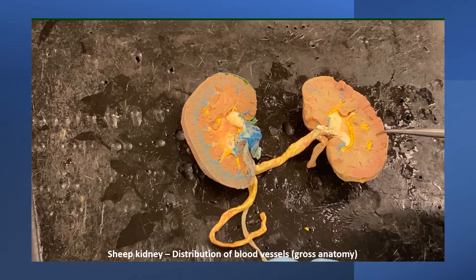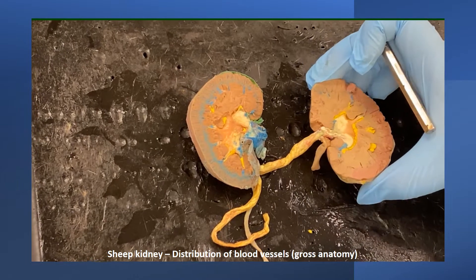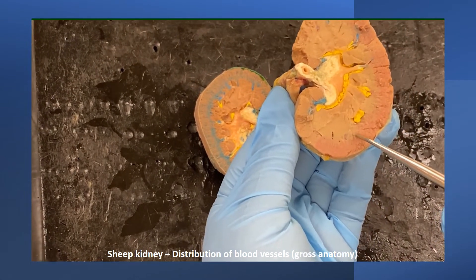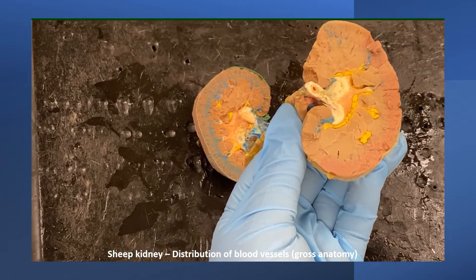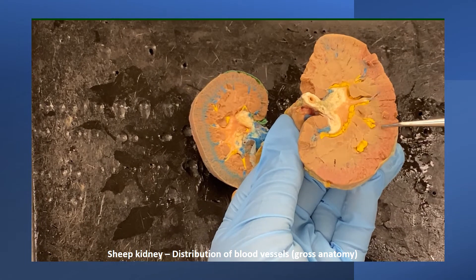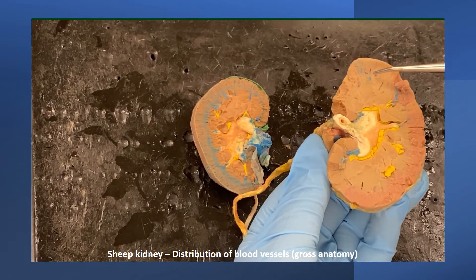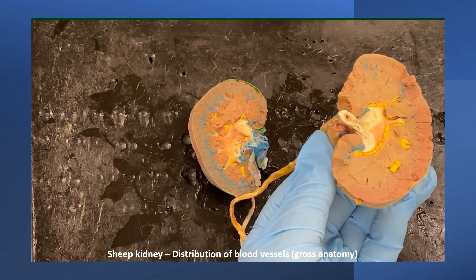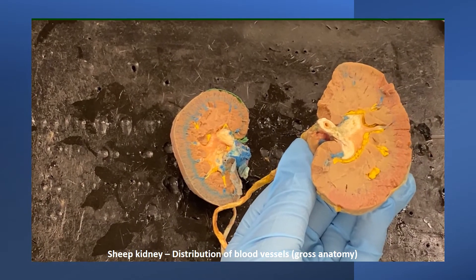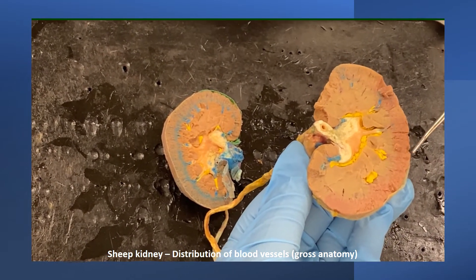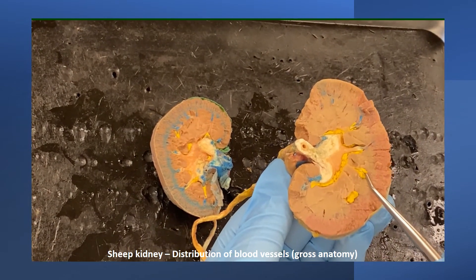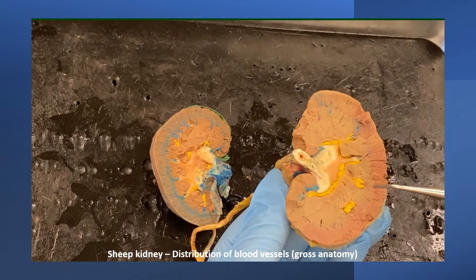Then the artery branches in between the renal pyramids — that will be the interlobar artery. If you look carefully, there is a distinct mark in between the cortex and medulla. Right around that boundary line, the distribution of blood vessels is called the arcuate artery, and there is an arcuate vein parallel to that as well. Branching off from the arcuate artery, these are called the interlobular artery, or cortical radiate artery, as they radiate in the cortex. Here you can faintly see the interlobular artery and this is the region for the arcuate artery.